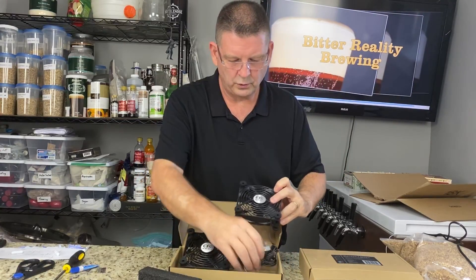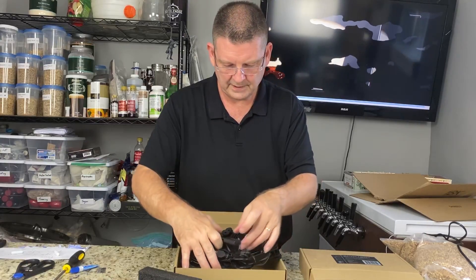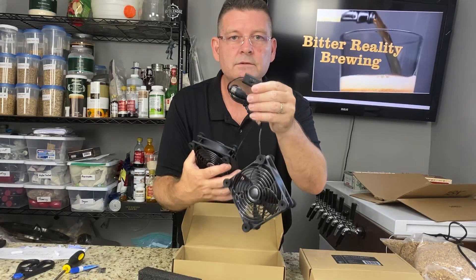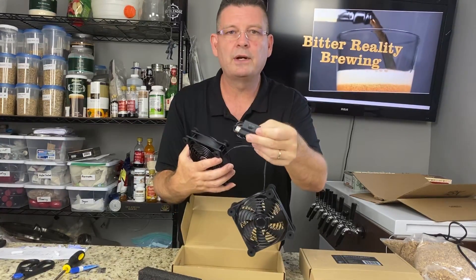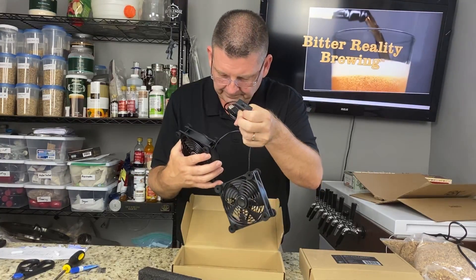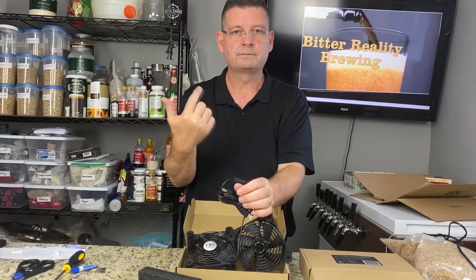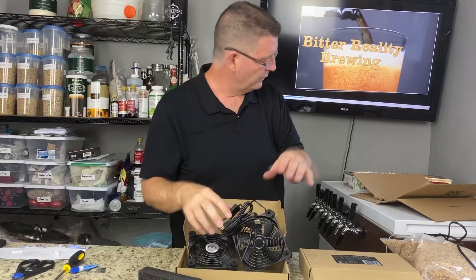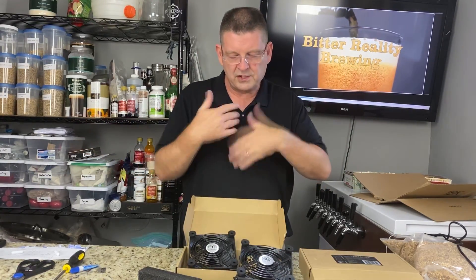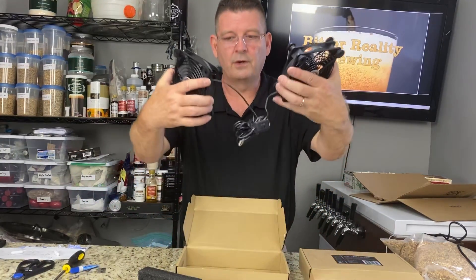These things are USB controlled with little bumpers — this is the coolest thing about them. This has a speed control: off, low, medium, and high speed. Rarely do I do high speed — medium is usually plenty fine. Because you're slowly elevating the speed, the stir bar gets moving and then starts spinning. With other systems, a lot of times the stir bar will slam to the side and you have to start over. Who wants to do that? That's annoying.